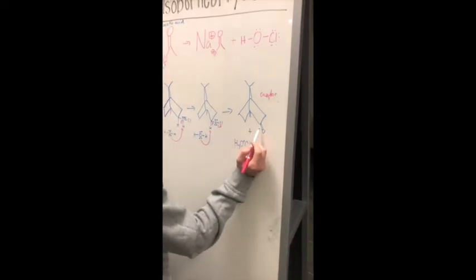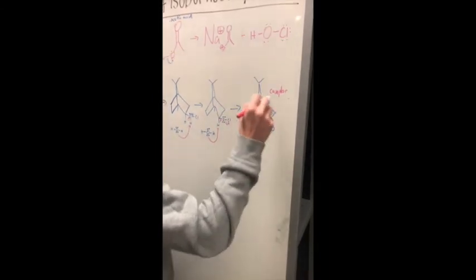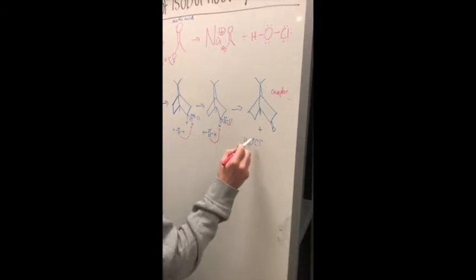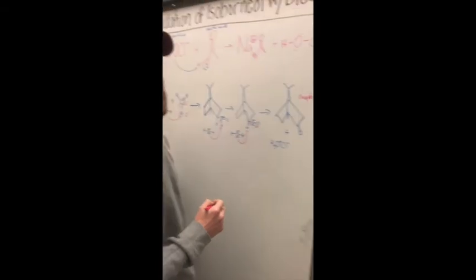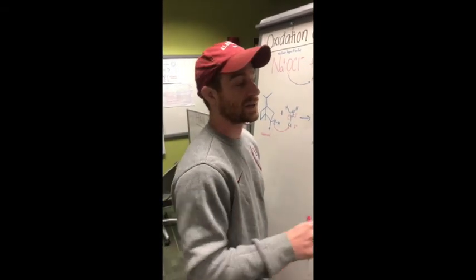See, we've got a secondary alcohol converted into a ketone right here. This is actually camphor, and the byproducts are H3O+ and Cl-. So if everybody does what they're supposed to do, then we'll come out on the winning side and produce camphor.